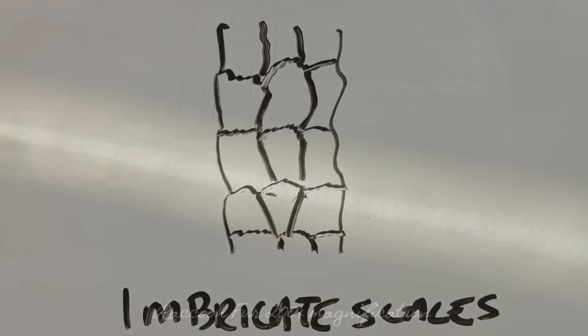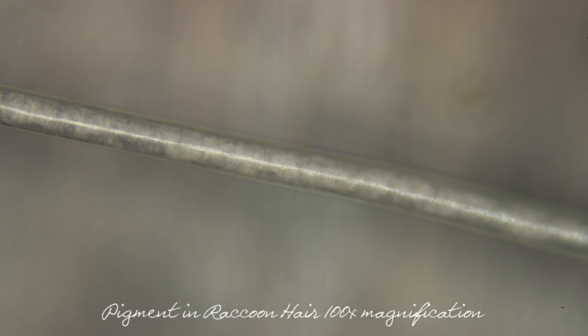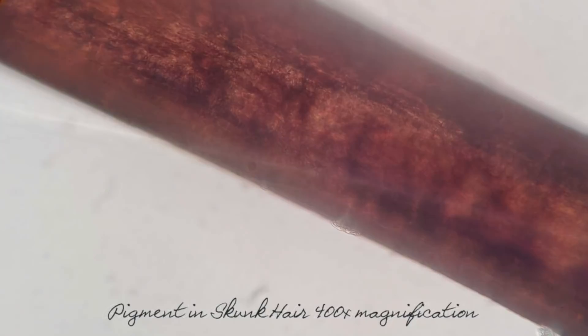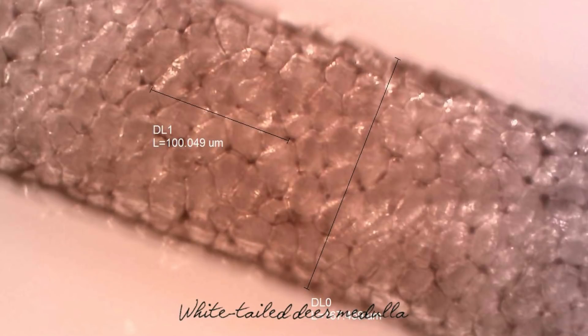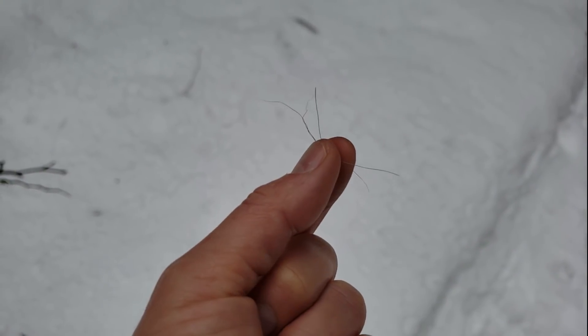Imbricate scales look flat and overlapping — a very common pattern in the animal world. In the cortex part of the hair, color pigments are contained. Human hair typically has pigment toward the outer part of the hair shaft near the cuticle, while in other animals it's toward the middle near the medulla. If you find fur that has been dyed, you'll notice color pigment directly in the cuticle. The medulla is the central part of the hair and contains cells; in some species there is air in this region.